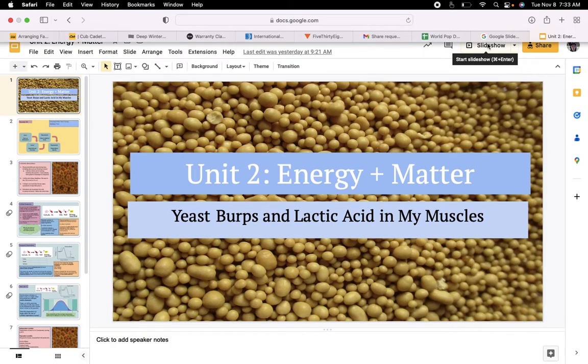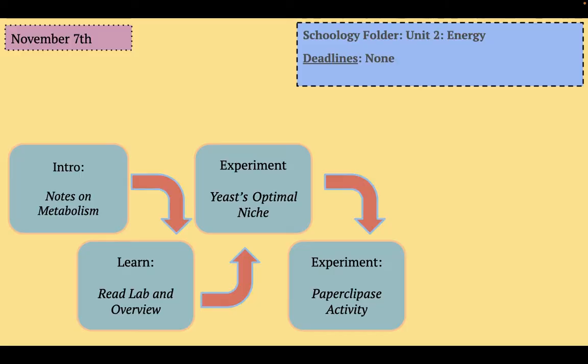A quick overview of what we are doing right now with energy and matter. As you know, right now we're doing an experiment looking at yeast's optimal niche in terms of cellular respiration as a function of temperature.